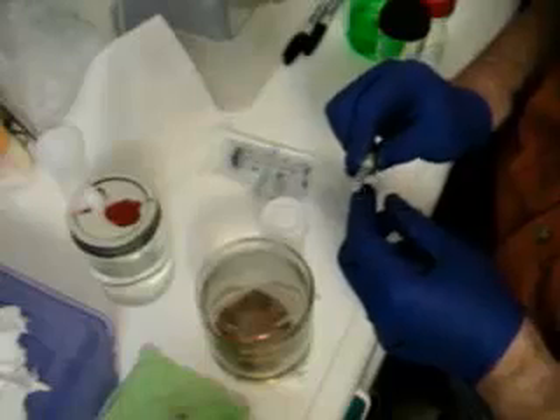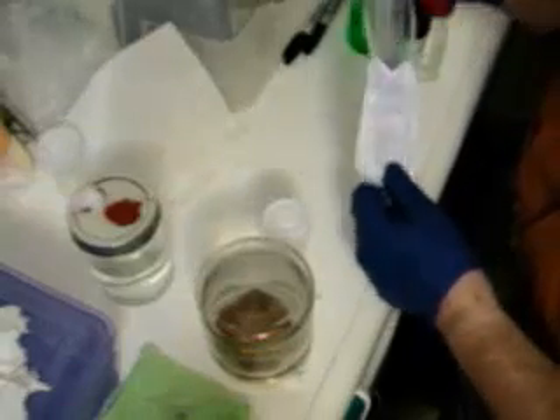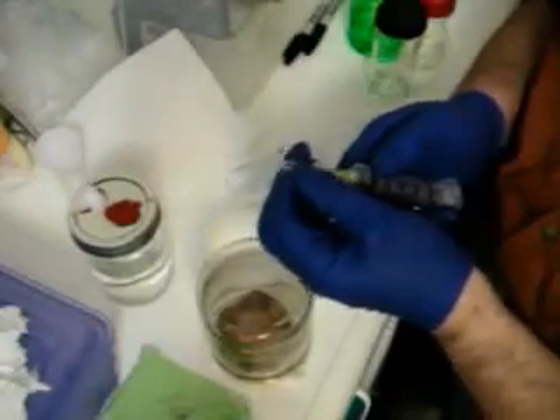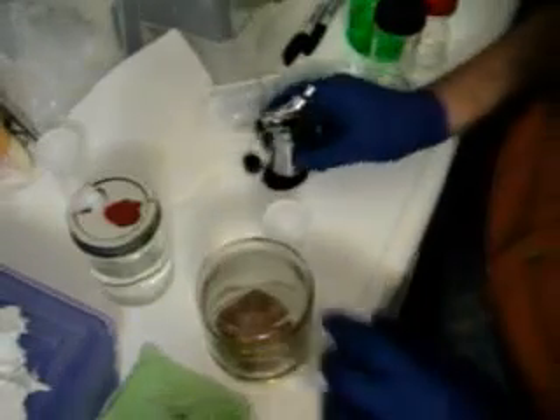This might be a used needle, but it's been soaking in alcohol. I keep my extra needles in a little sample jar with rubbing alcohol in it so that they stay clean. And something to flame sterilize with.